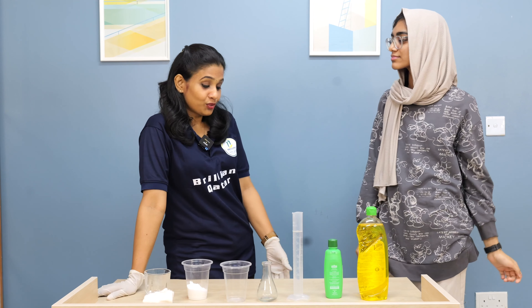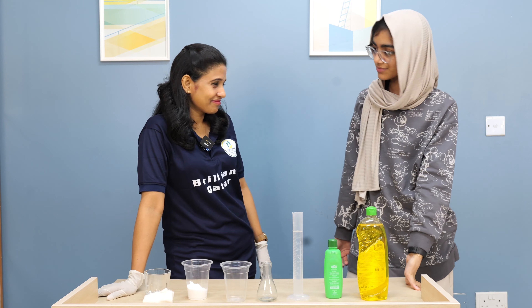Yes, you missed it. Could you please demonstrate it again for me? Yeah, sure. So, what are we going to do now? We are going to do the extraction of DNA.